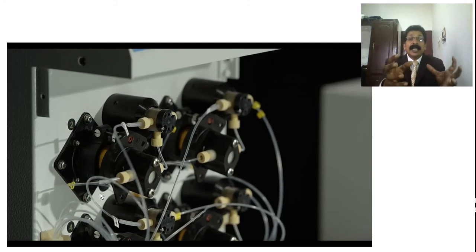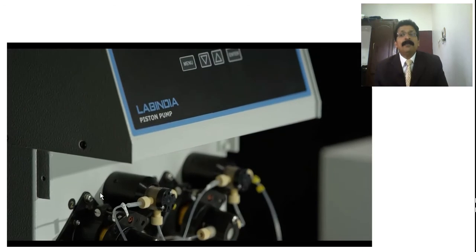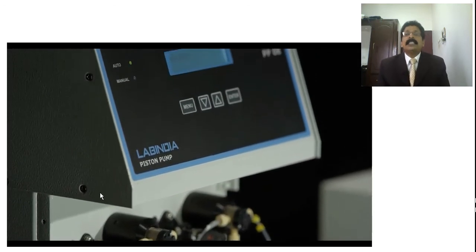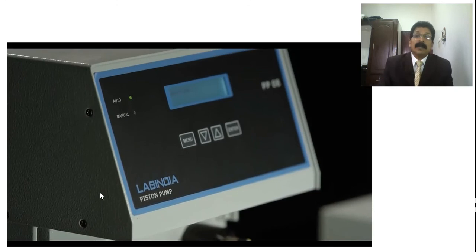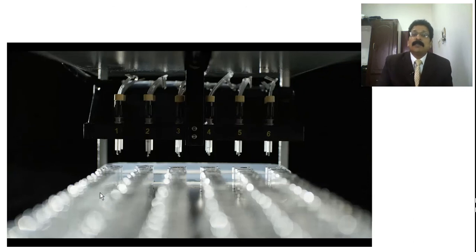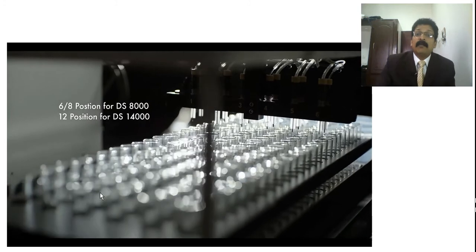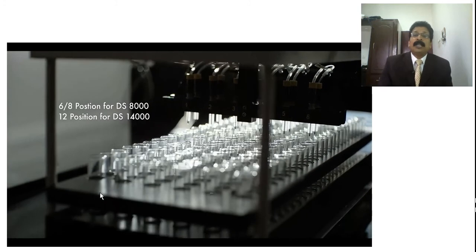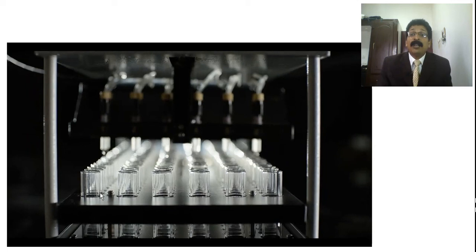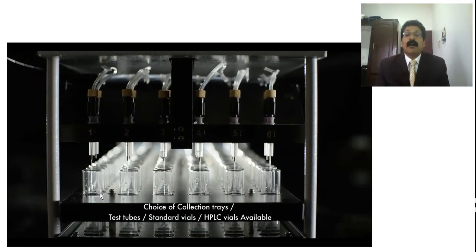It will take the samples automatically. Every minute means every minute, every half a minute means every half a minute, every 2 minutes means every 2 minutes. That is decided by the operator, and when you feed that, you see how the sampling takes place automatically. Instead of pipetting, it will give the exact amount. If it is 0.1 ml, it means 0.1 ml, 0.5 ml means 0.5 ml, 1 ml means 1 ml. It will automatically bring it to your test tubes or your standard flask, so that it will be taken for the next step of HPLC for identification.